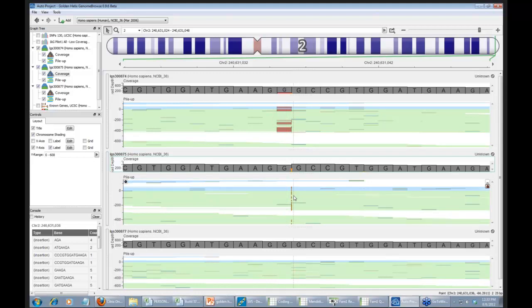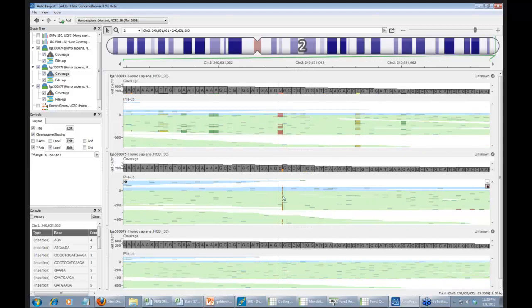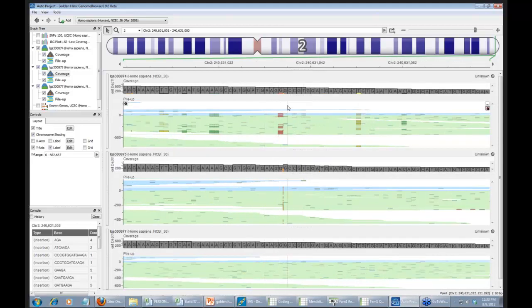And insertions and deletions cause a lot of problems with the alignments and a lot of artifacts, and polymorphisms will be called that are just due to a misalignment. And so actually, it turns out that because of this insertion deletion, the child actually has the insertion deletion, but because the sequence quality was either a little bit lower, or the coverage wasn't higher, it made a number of false calls for polymorphisms. And so whenever I look through these alignments and I see an insertion or a deletion in one of the parents, that's usually a very good sign that what you're actually looking at is a sequencing artifact.